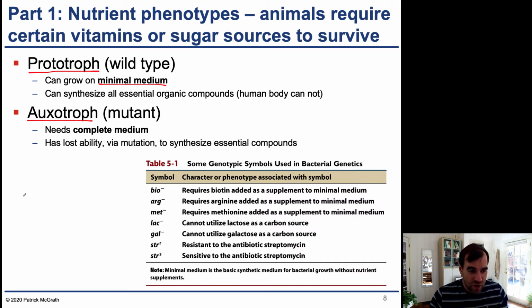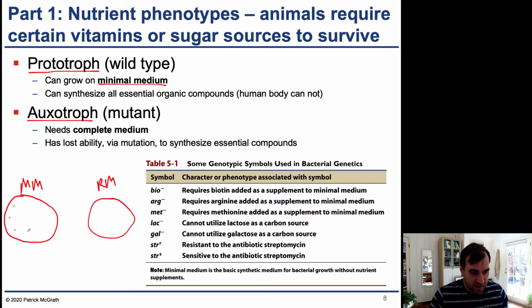And so you might have a plate that is minimal media. You might have a plate that is rich media. And you have bacteria that we've made a replica plate of, so you can imagine this colony is in the exact same position as this colony.